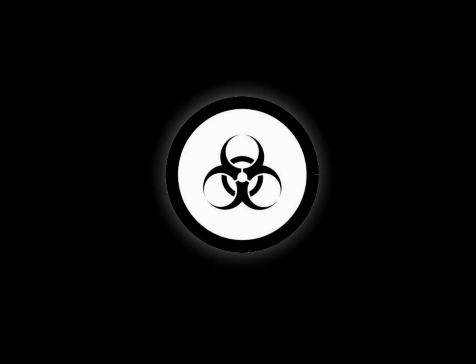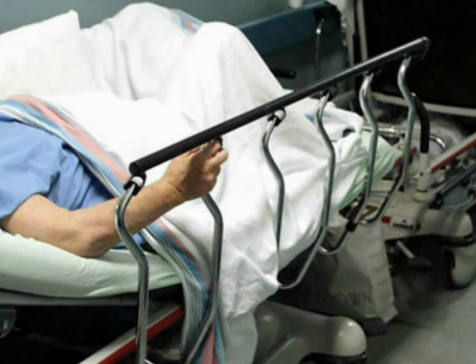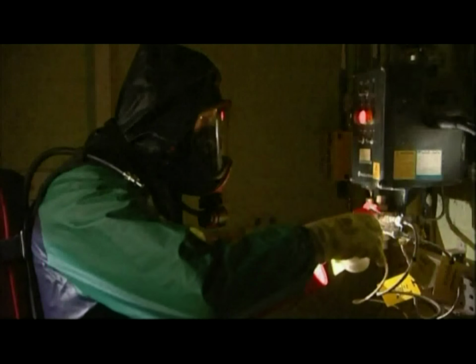This means that the material may cause a serious disease resulting in illness or death, may produce a toxin that is harmful to humans. Therefore, you should avoid contamination by wearing protective equipment. Handle the material only when fully protected by the proper designated equipment. Handle the material in designated areas that are approved by your immediate supervisor.